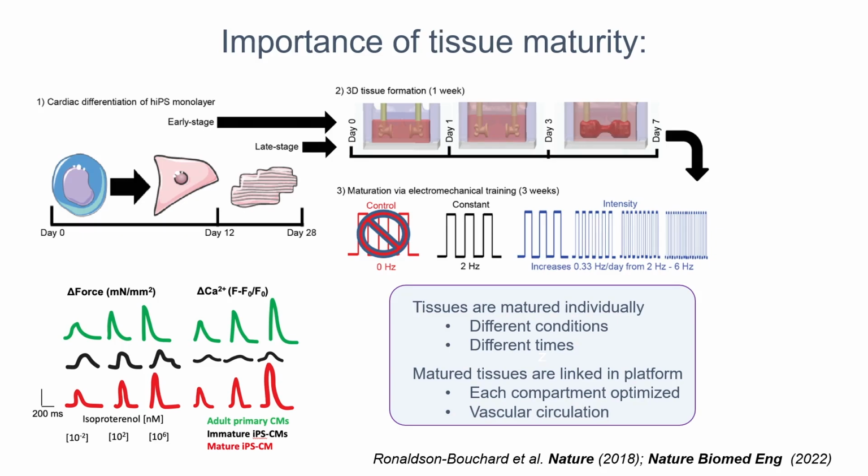What we found is, you see here at the bottom left, if you look into the response of this heart muscle to increasing concentrations of isoproterenol, what you would need to see are the responses in terms of measured force that we do by looking into pillar deflections and calcium in green.